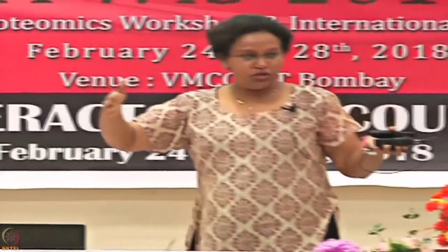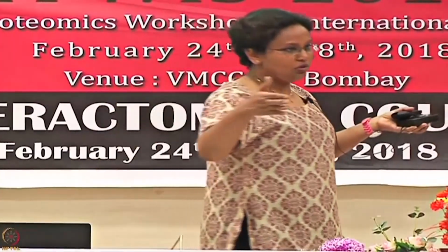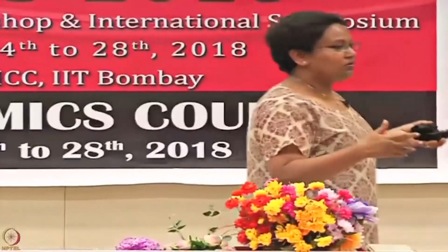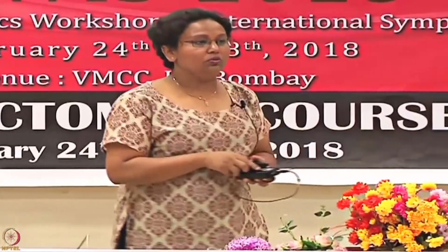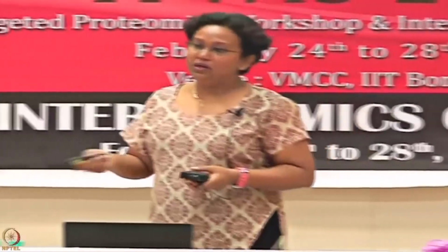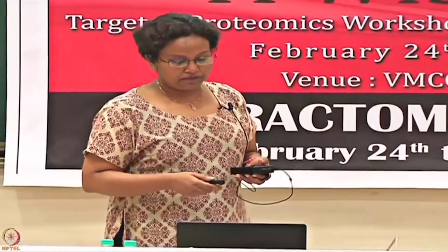That's the surface saturation. And when you're doing kinetics, you should never be in a saturation mode. There is something called mass transport limitation that happens, which actually affects the concentration of your analyte. So you would have to keep your ligand concentration extremely low, otherwise you get erroneous kinetic results.